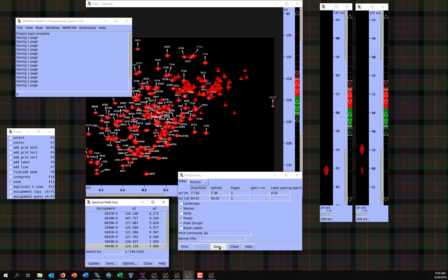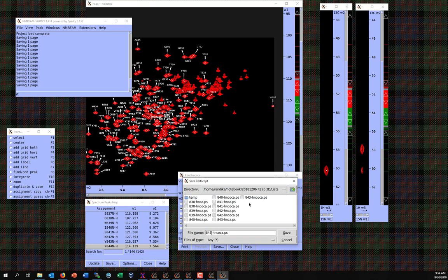And if you need to change a contour level, at least put that in your figure when you report it, either in your poster or in your publication.